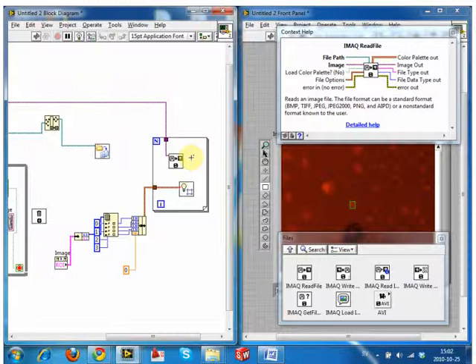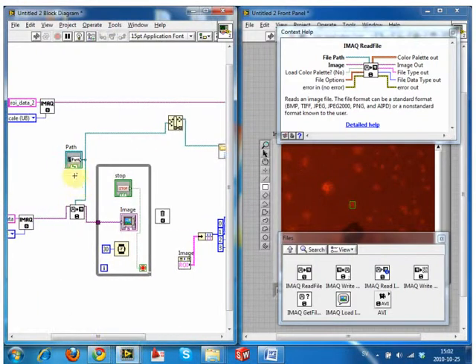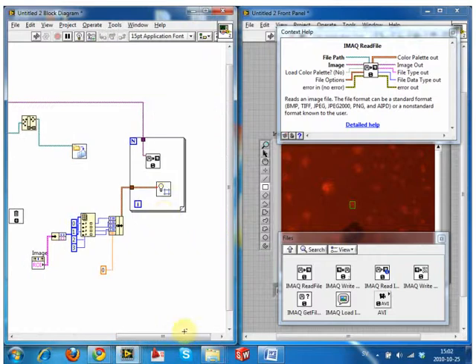Okay. So this is essentially reading a file. I'm putting it into the memory, just like it was at the start, where we've got a file path and it's reading it and putting it into the memory. And we have a list now of all of the files that are in there.